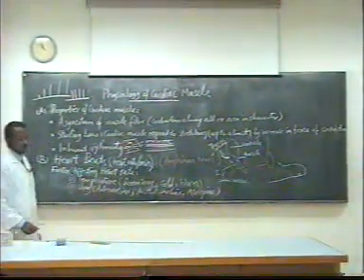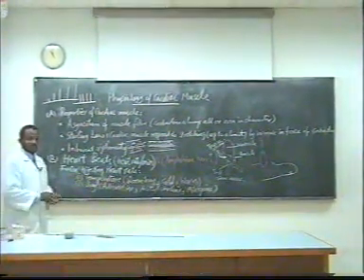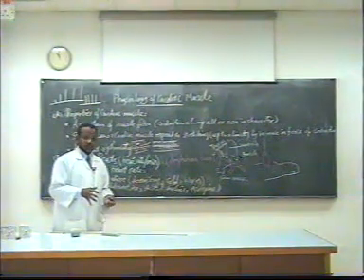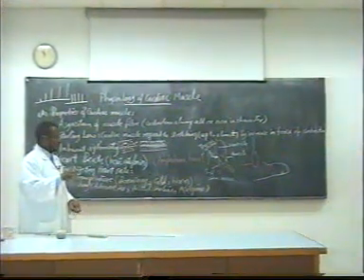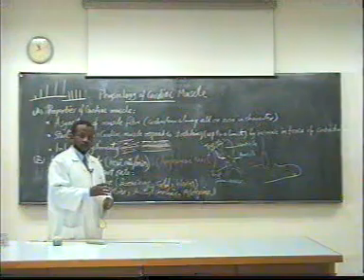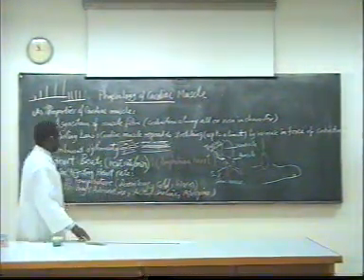The cardiac muscle also is characterized by inherent rhythmicity. That means even if we isolate the heart from the body and keep it in a solution, the heart keeps on contracting. Even if you cut the heart into small pieces, each part will continue beating.